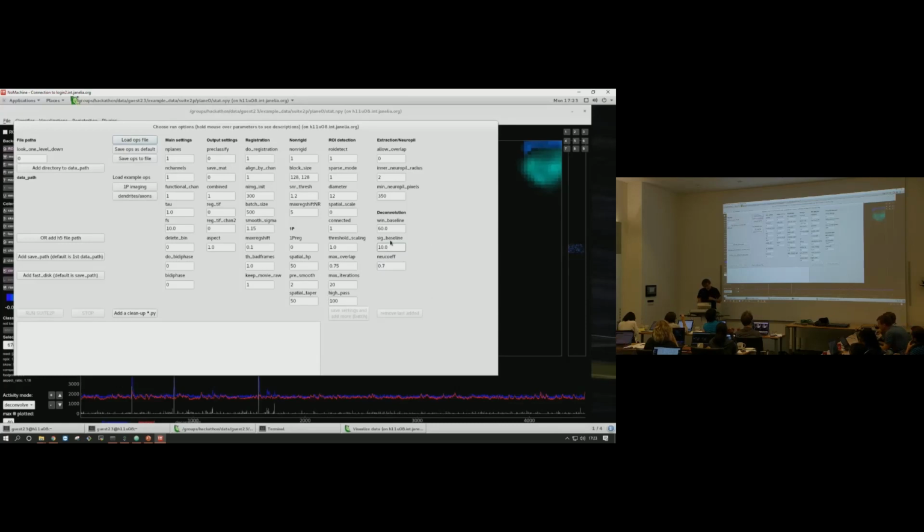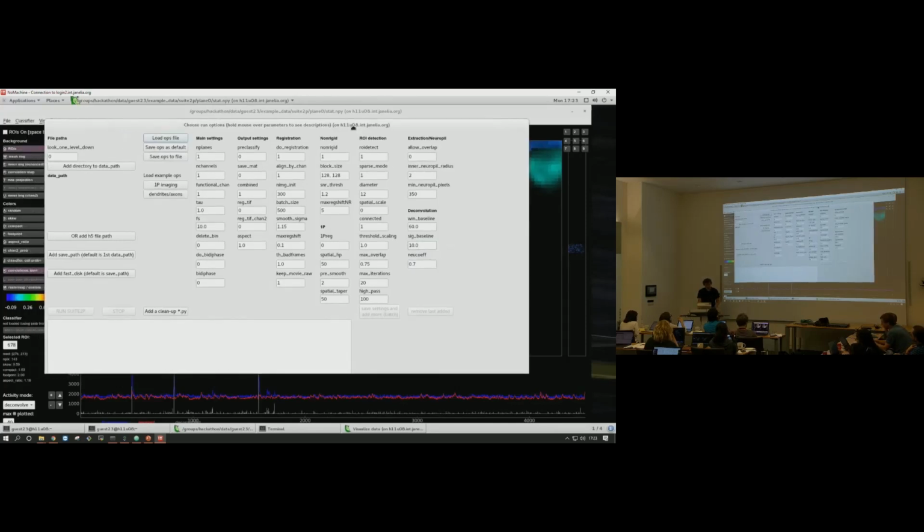All right, and that's it. Both of these are just parameters for windowing that baseline. And then the deconvolution runs through. And that's it. That's the exposed settings. There's a few more that are hidden, but they should have even less of an impact than these. All right, questions?